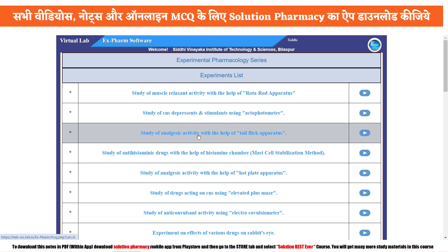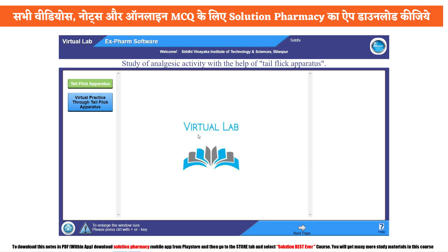To start the practical, just click on the object. This object is based on in silico software called Xform software. Usually we perform experiments on real animals, but as per the guidance of different agencies, we need to use in silico software that will reduce dependability on experimental animals.